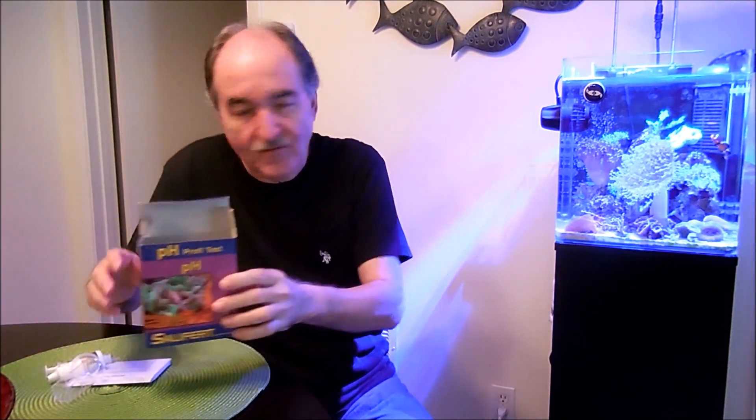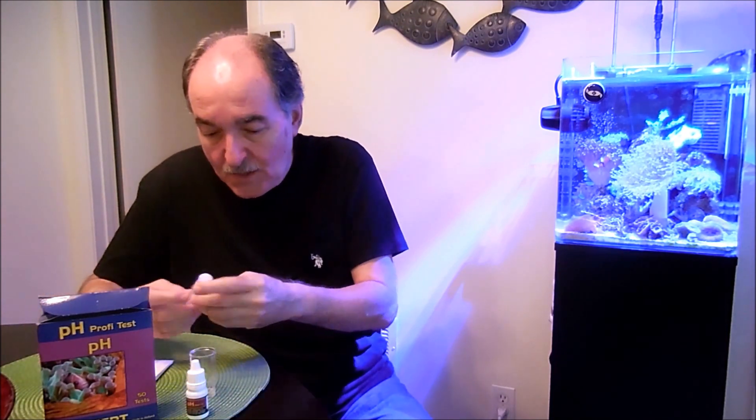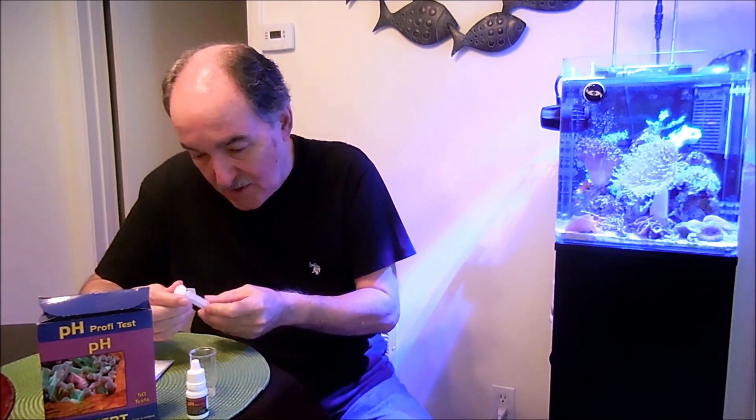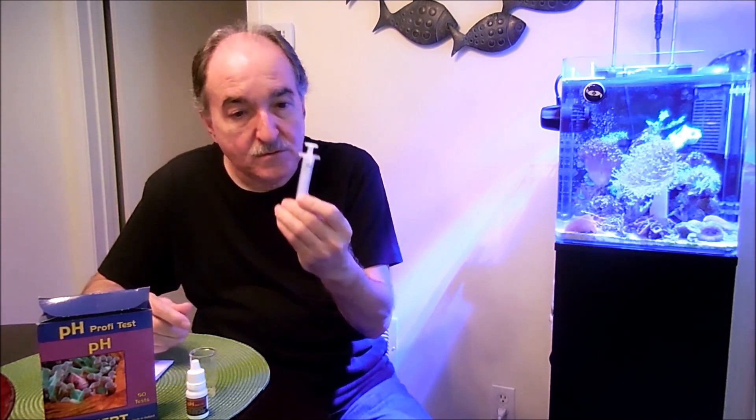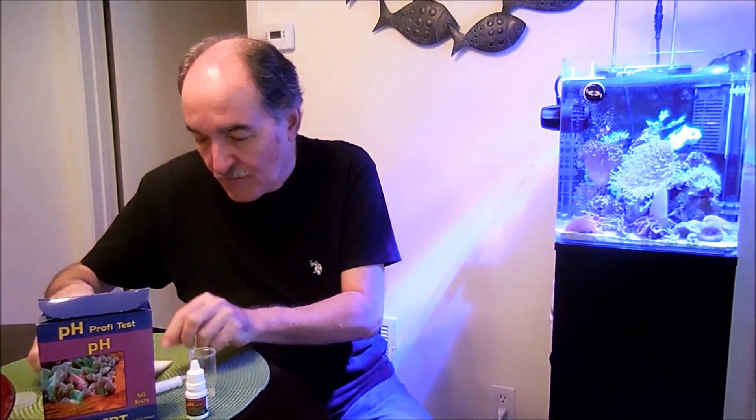Let me show you what it is all about here. Very simple test kit. It has got the vial, the container where you are going to do the testing. It has got the pH drops. And here we have a 5 ml syringe. It has got a little cap but I don't use it. Of course the instructions, and then the chart where you are going to compare.